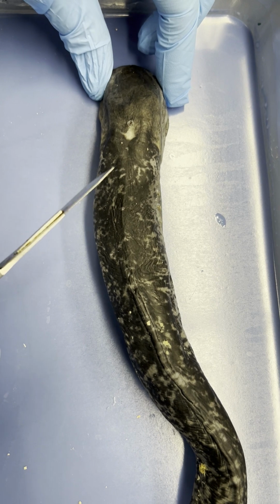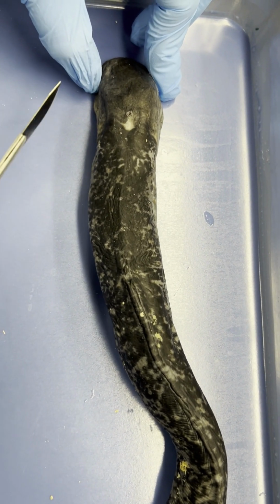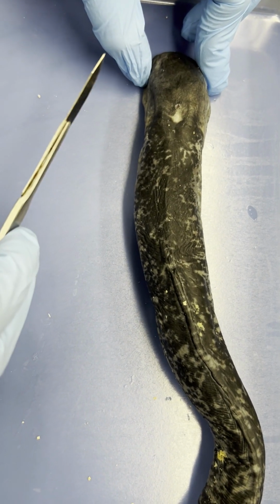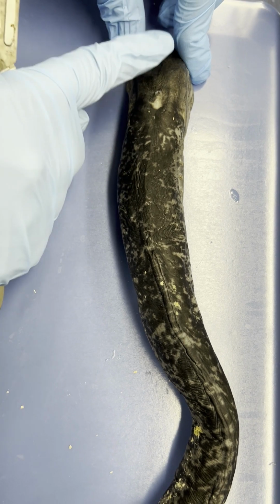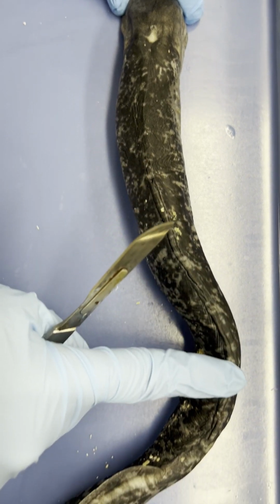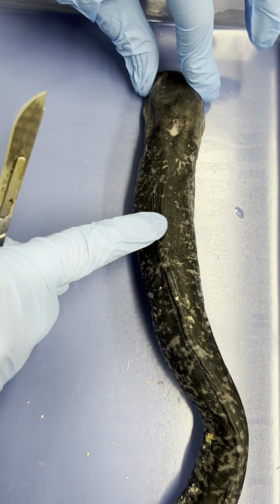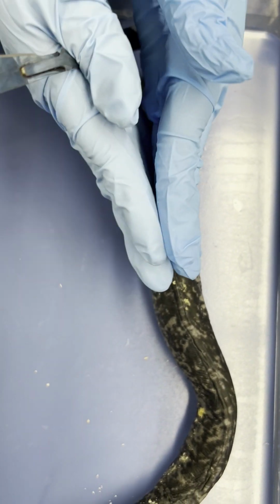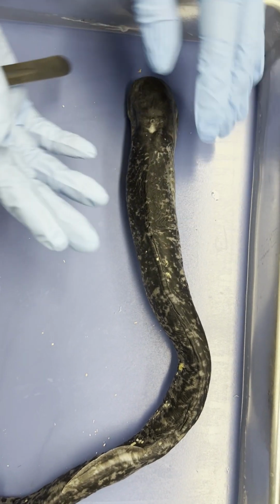Hi guys, this is Dr. Mick here. Dr. Mason is behind the camera this time. So we're gonna do what's called a sagittal cut on this lamprey. So when we're doing a sagittal cut, we're gonna cut along the dorsal, which is the back of the animal, along the midline. So that way when we have our cut, we'll essentially be putting it into two halves, like if you were opening a sliced hoagie, for example.